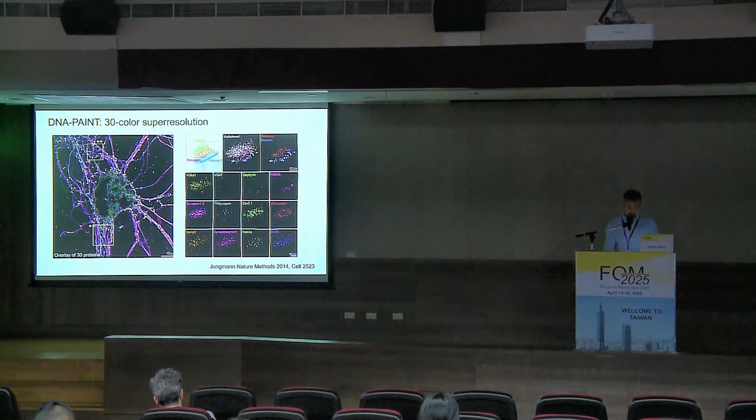And this is some really amazing results by the Jungmann lab, where they imaged neurons in 3D in 30 colors and could beautifully resolve the relative arrangements of proteins here in the synapse.